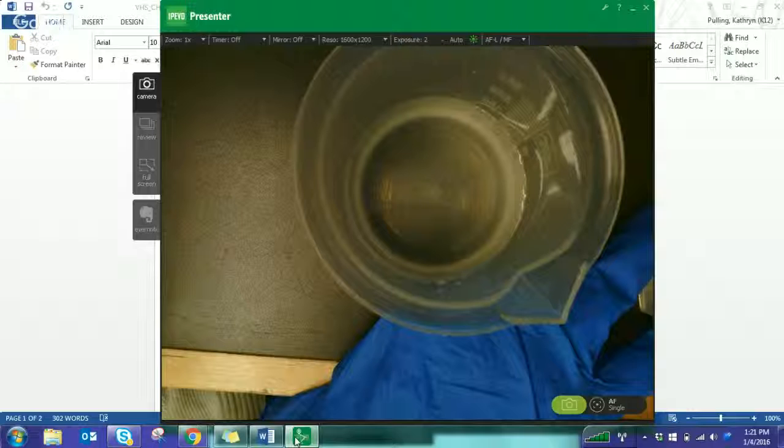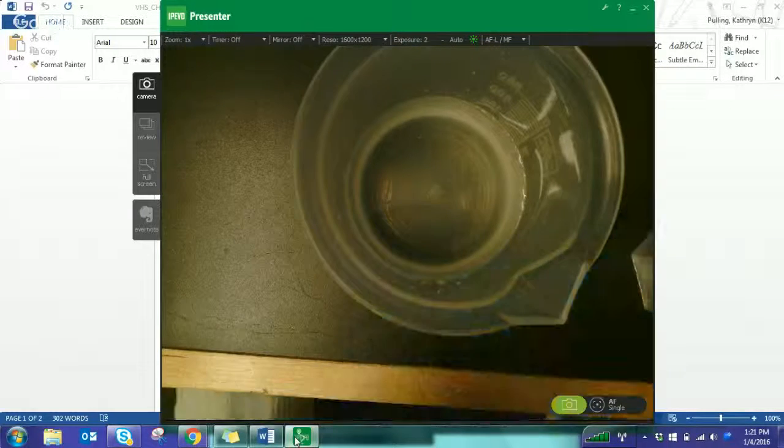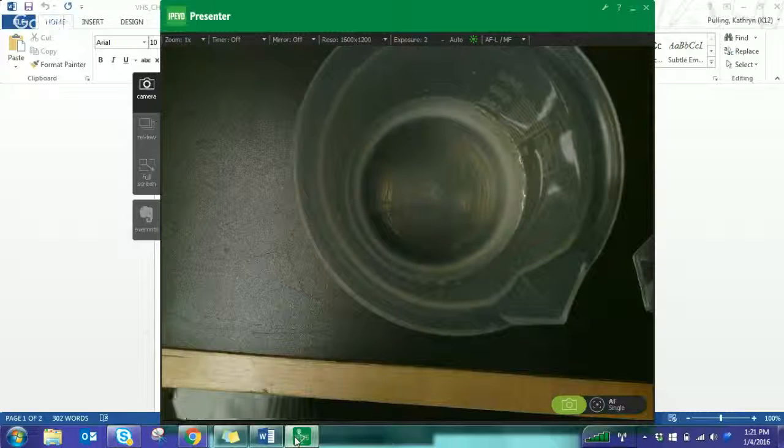This is going to take a little while to get 10 milliliters because it's a little squeeze bottle. I actually might go slightly under 10 milliliters. I think I'm going to add 9 just to make sure that I have at least that much for next time, in case our people at the K-12 headquarters didn't exactly get the right amount in here.